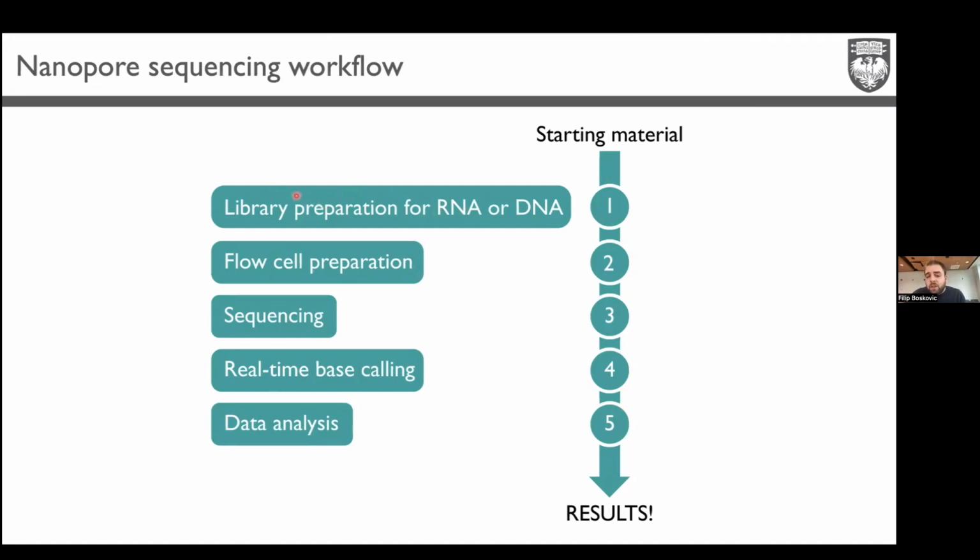So the first step is library preparation for RNA or DNA of any kind. And usually the kits provided by the company can guide you in a very detailed step-by-step manner, even going into tips and tricks, like how to avoid the introduction of bubbles in the device and so on. The protocols you can only access once you log in and create an account on the company's website.